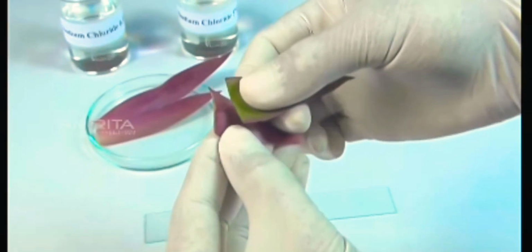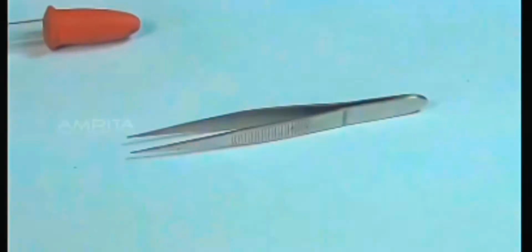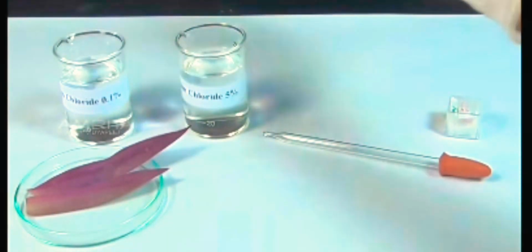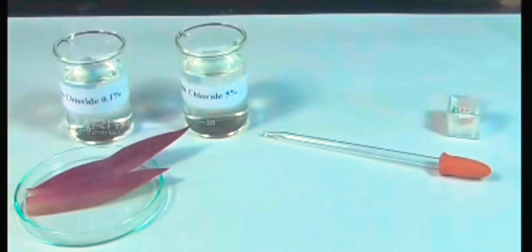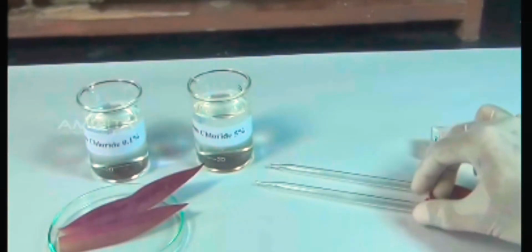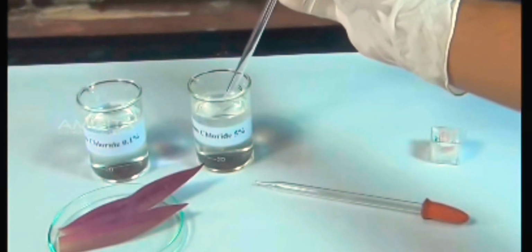When you take off the peel from the lower epidermal layer of the Rhoeo leaf, one piece should be dipped in 0.1% NaCl. That will act as the control set, where the concentration of the solvent is more, and another peel will be kept inside the 5% NaCl, which will act as the hypertonic solution. After keeping this whole setup for 20 to 30 minutes, we will observe it under the microscope by covering it with a cover slip.